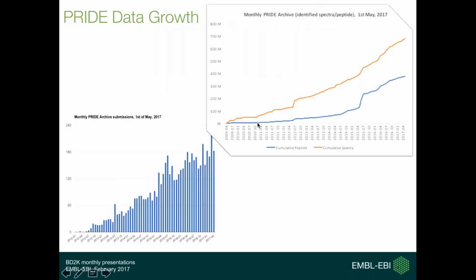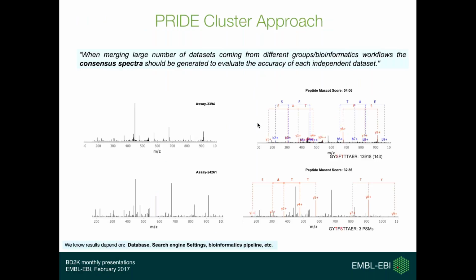And to condense all this dataset and peptide evidence, we published in 2016 the PRIDE Cluster approach, which is actually going back to each spectrum that is submitted to PRIDE, and we cluster them all together. With that we can assess, across the entire resource, the quality of each peptide evidence. Then we can say, with some p-values or score, that this peptide is relevant across the entire resource.